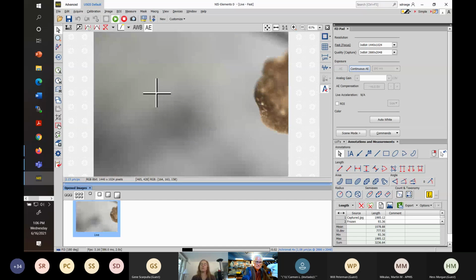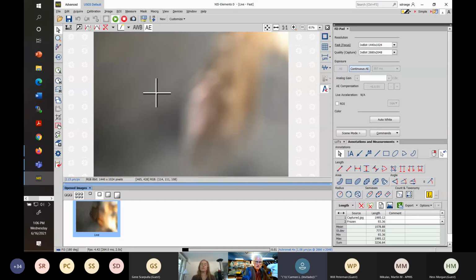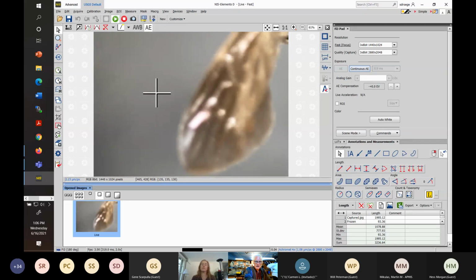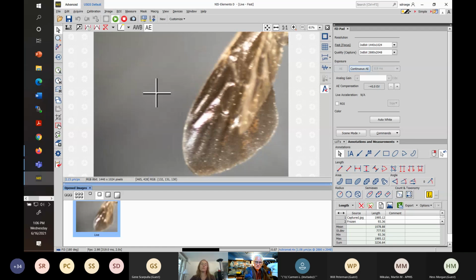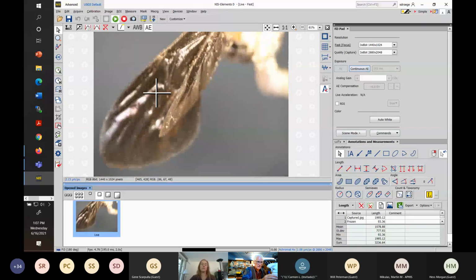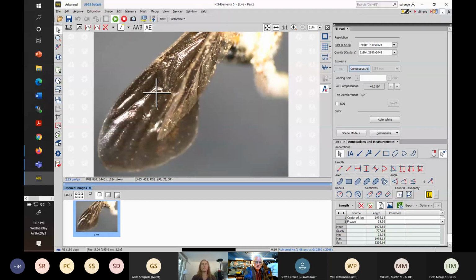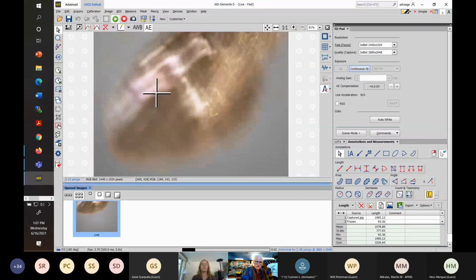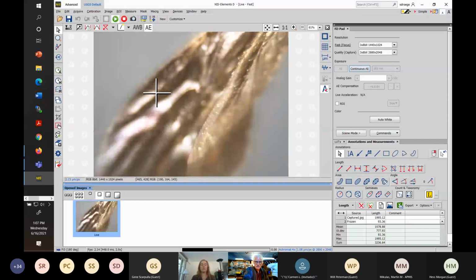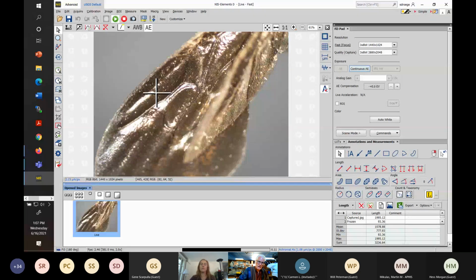Okay, so now I should have clicked on that particular wing shot. We're going to see that within many of the groups within Megachilidae, you have, instead of the more common three in Halictidae and elsewhere, a two-celled submarginal wing situation. This is a very dark winged specimen, so it's a little bit tricky to see compared to the more clear winged ones, but it should be good enough.